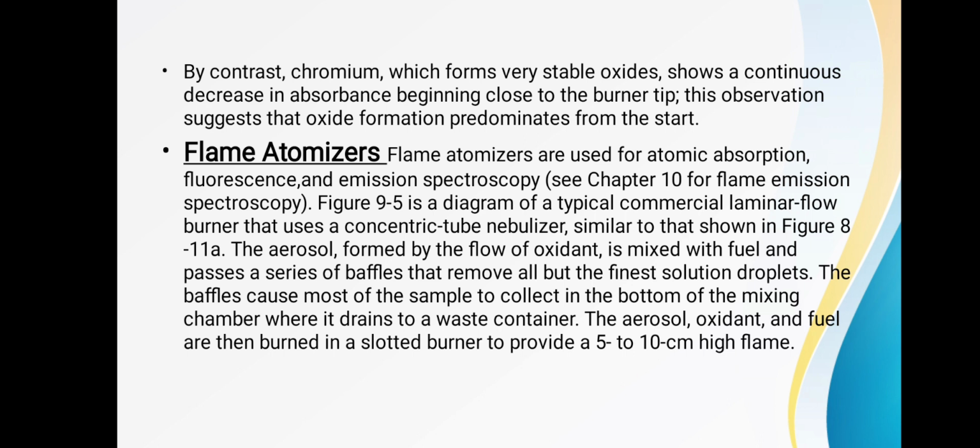Flame atomizers. Flame atomizers are used for atomic absorption, fluorescence, and emission spectroscopy. The figure is a diagram of a typical commercial laminar flow burner that uses a concentric tube nebulizer, similar to that shown in the figure. The aerosol formed by the flow of oxidant is mixed with fuel and passes a series of baffles that remove all but the finest solution droplets. The baffles cause most of the sample to collect in the bottom of the mixing chamber, where it drains to a waste container. The aerosol, oxidant, and fuel are then burnt in a slotted burner to provide a 5 to 10 cm high flame.